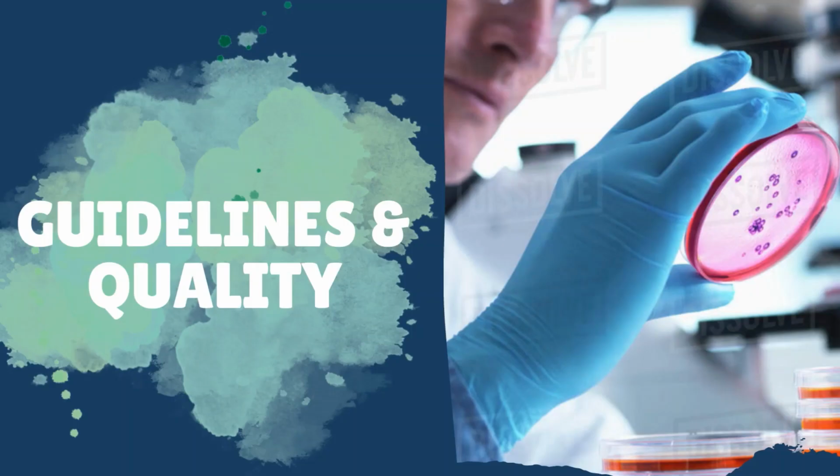One of the important aspects in designing a lab includes guideline and quality. Guidelines are needed so that good laboratory designs allow scientists as well as technologists to conduct their work in the most efficient and safe manner and in a laboratory that will be in compliance with all relevant regulations, while quality management assures the reliability of all aspects of the operation.